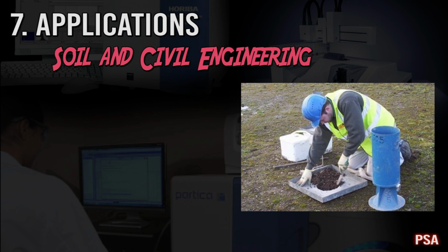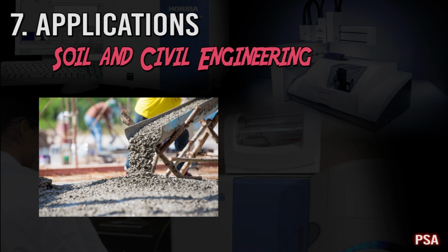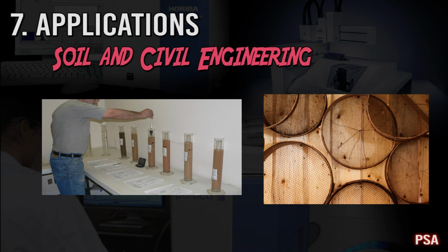This permits them to control the material fabricating condition and to accomplish superior, safer, and more efficient materials. The particle size distribution of soil and cement has a large effect on the strength and stability of the supporting ground, wherein the testing of materials by use of the particle size analyzer is the foundation of strength of buildings and other structures, and of how much this changes over the long run after it was built.